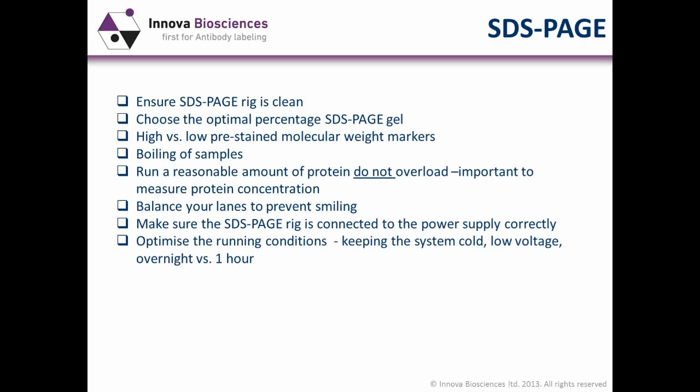I can only hypothesize it was to do with the hydrophobicity of the protein itself. But again, if I tried running this through a mini gel system for 1 hour, I had no success, even if I ran it at a lower voltage. So again, just to reassure yourselves, it's key that you optimize the running conditions for the protein of your choice.